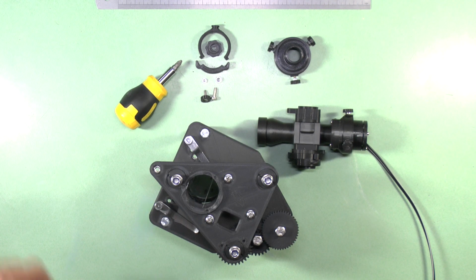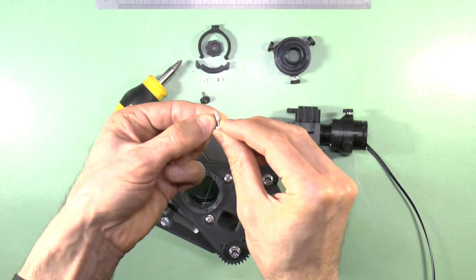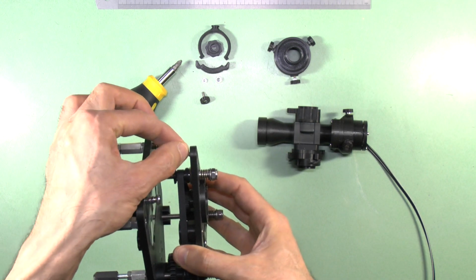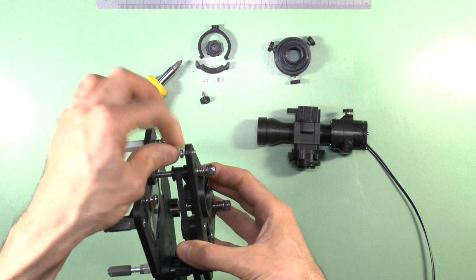To use this stabilizer, first insert a 12 mm long M4 screw into the front M4 nut of the focus platform, but do not use a washer. You should tighten this screw, we won't need to adjust it.